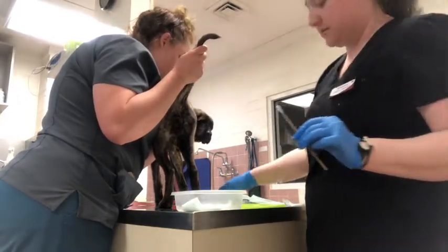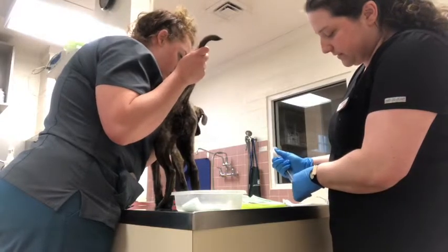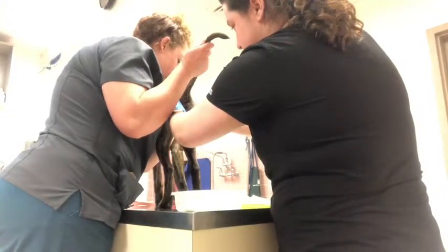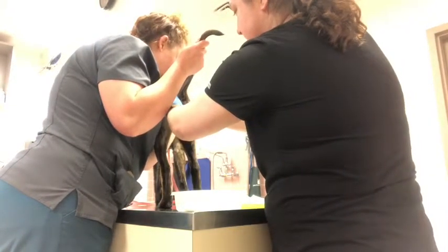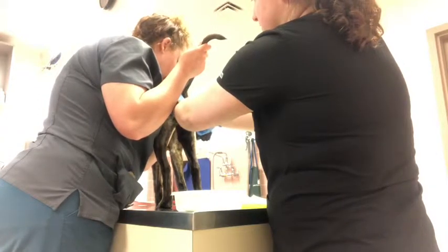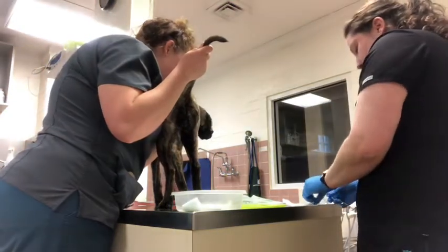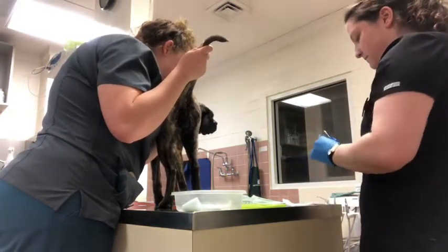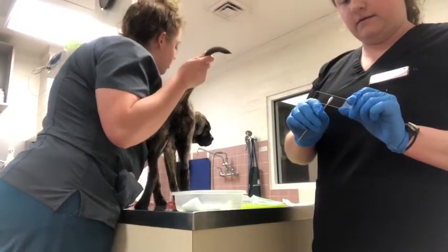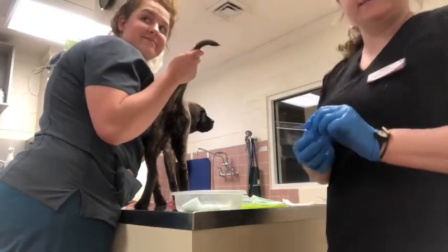I have my sterile swab that I'm going to wet with sterile saline, and then I'm just going to insert it into her vulva and swab the inside. Then I'll take my slide and roll my specimen across the slide, and then I'm going to stain the slide.